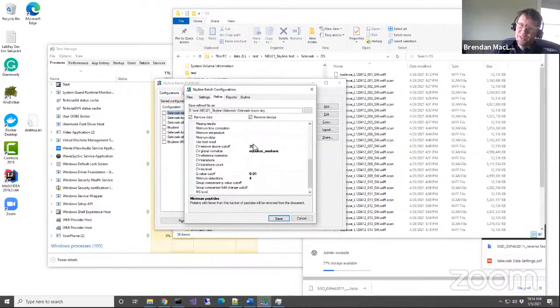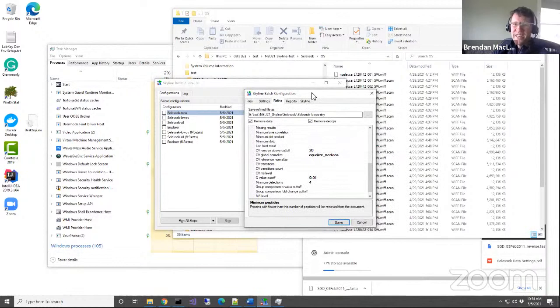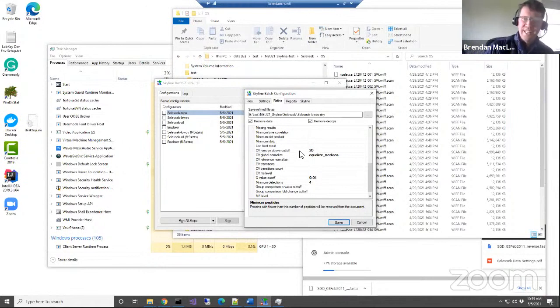final analysis when we analyze the quantitative data, the osmotic shock data, with either low CV or, hey, we're just going to try everything. So the experiment here is, can we improve what we get out of MS stats if we give it cleaner data? And then the final cutoff is we also say, hey, if we couldn't detect it in at least 4 of the 8 runs, we're not interested in it either. So we're saying high reproducibility of finding the thing, and then once we find the thing, that we have a pretty good CV. That will cut out a fair number of things.